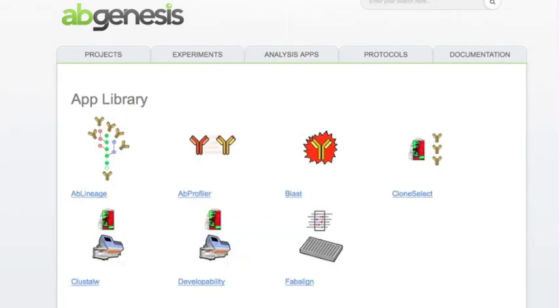Knowing that not every question you might want to ask can be preloaded into a report, we also created an Analysis Apps tab. This Analysis Apps tab makes it extremely easy to add new types of analysis into the environment to enrich your ability to ask questions within experiments, and across all the projects. We perform BLAST, profiling, pairwise comparisons, and really extend any new type of bioinformatics that we will do and spread out to our users, and you can do internally and share your bioinformatics with others, creating an ecology of different computational needs to be able to address the ever-changing requirements of antibody repertoire analysis.